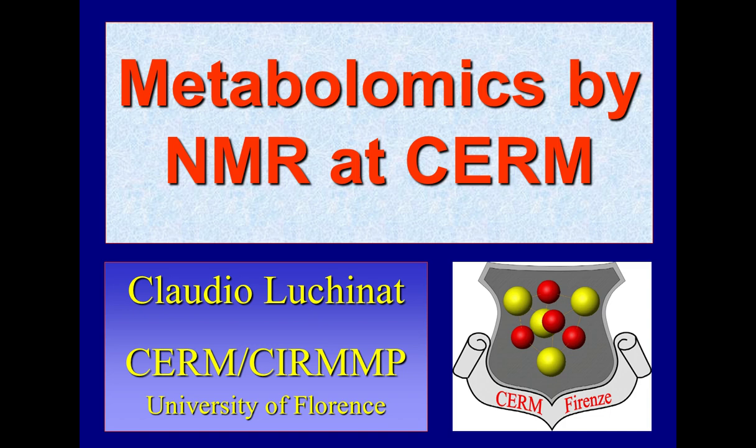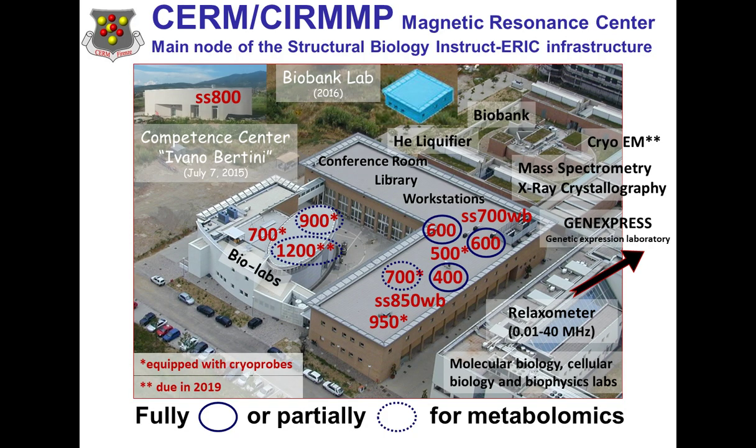I thought I should say who I am, so you already said that, and I would like to show the place where I'm working, and this is the Magnetic Resonance Center of the University of Florence. You see the numbers are the instruments, the various NMR instruments with their frequency in megahertz or field. The ones that are circled are the ones that are used for metabolomics. In particular, one of the 600 megahertz is an IVDR system, and so we are standardized in the sense that Manfred was telling a few minutes ago.